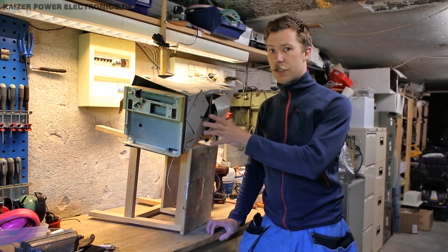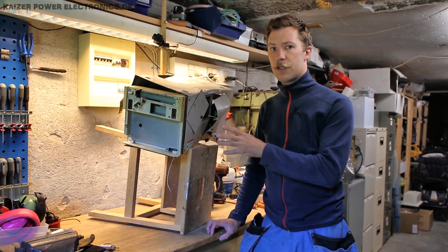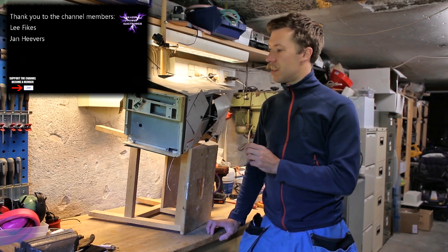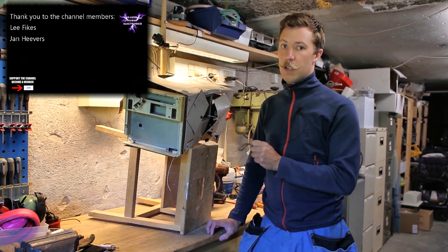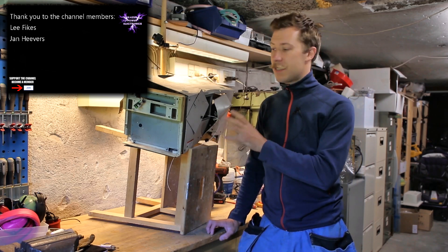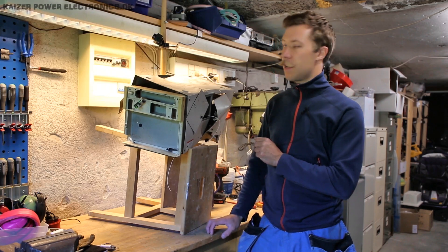This should contain some kind of a visible light source, but also a deuterium lamp, which is the source for the ultraviolet light. I'm looking forward to taking this apart and seeing what nice parts it has inside.